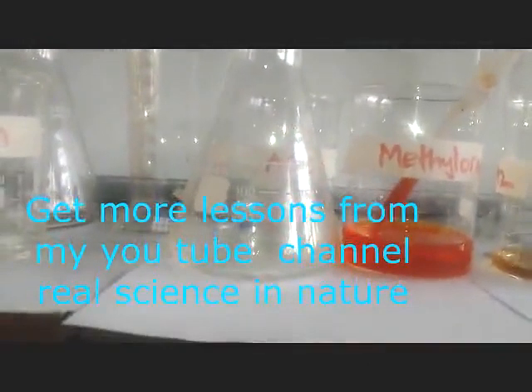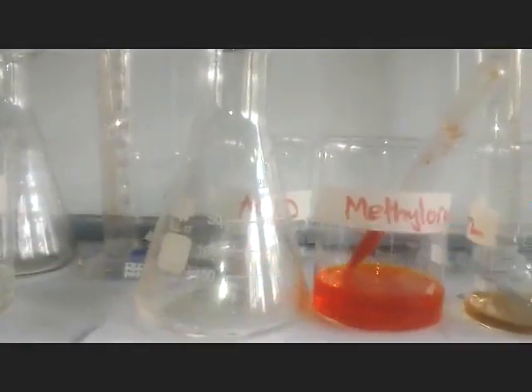Then let us try the same when you are using an acid. I'm going to get an acid which I used when I was carrying out that one for phenolphthalein. I put my acid there. Someone may say that maybe that one is not an acid. We can prove it by putting litmus.